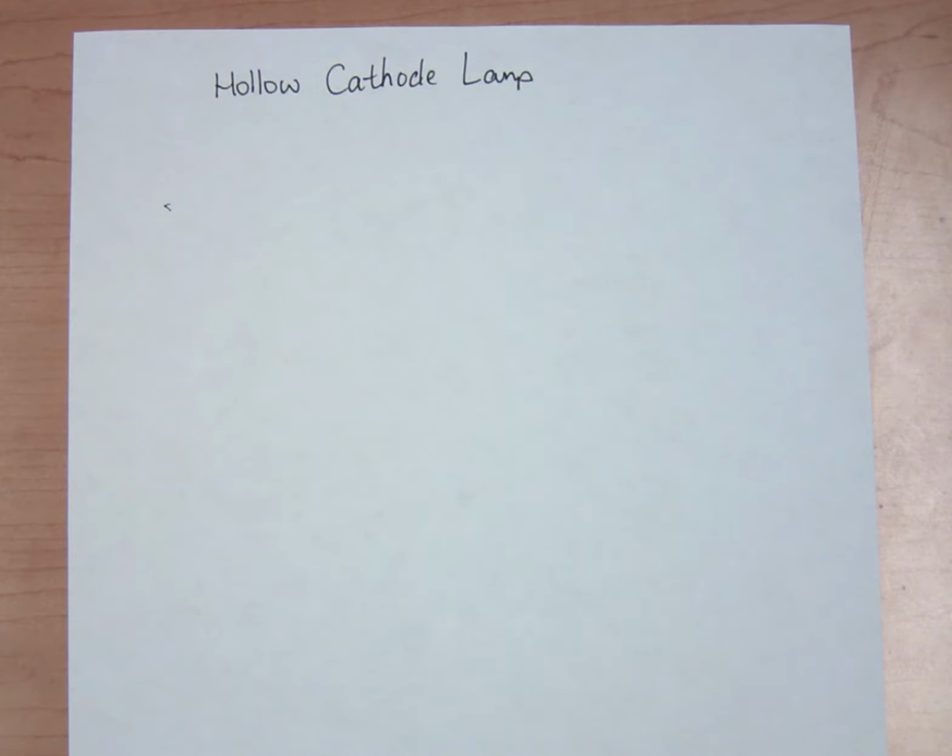For instance, in the UV-visible range, we might have narrowed it down to a single nanometer of width coming out of our monochromator. And that was sufficient because the absorption band of the molecule was 20 or 30 or 100 nanometers wide.